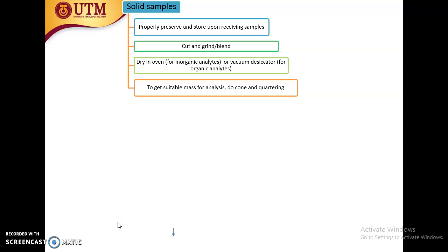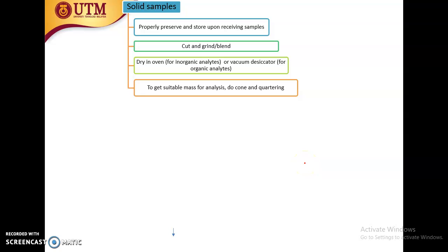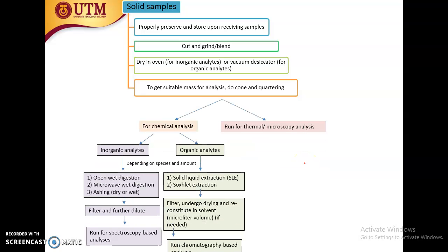Okay, we continue on selection of sample preparation methods when you have either inorganic or organic analytes. Since organic analytes don't withstand high temperature, the sample preparation will not involve high temperature and will not involve harsh chemicals.